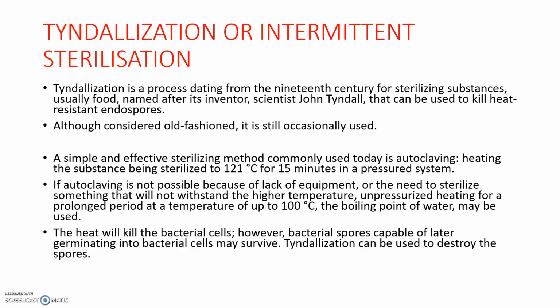This method is considered old-fashioned, but it is still occasionally used. It is a simple and effective sterilization technique.